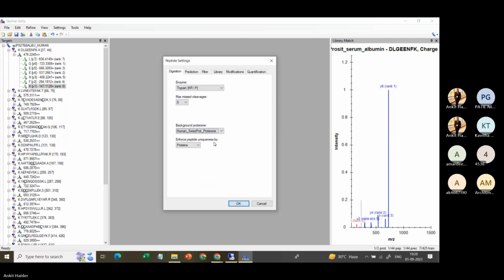Now here we are taking the proteins, digesting them into peptides, making the precursor-product fragment pairs, and then making our transition list. We instruct our mass spectrometer to check whether these transitions that we are specifying match, and give us the result.